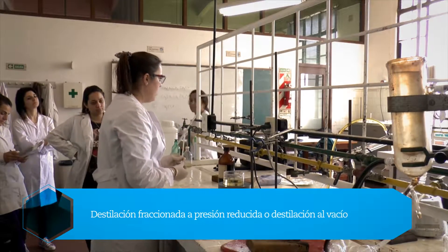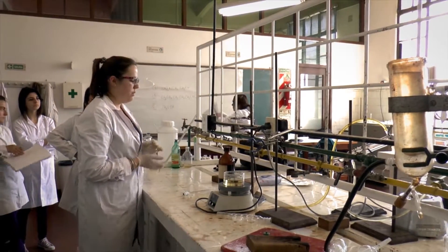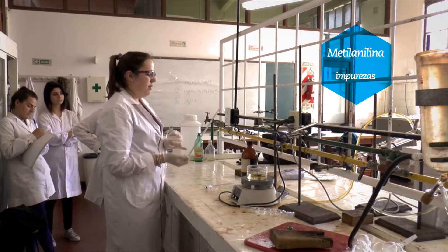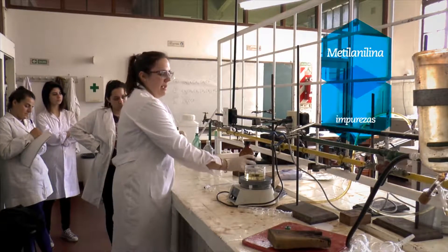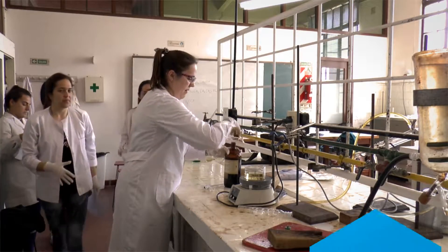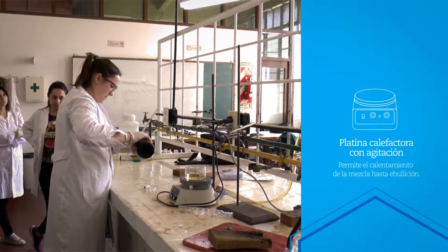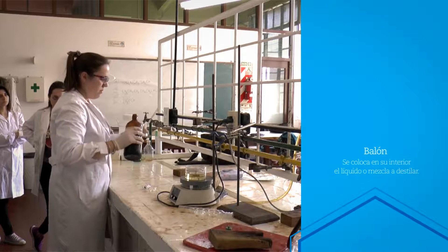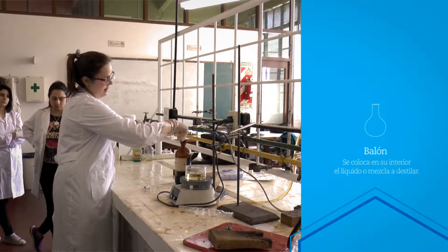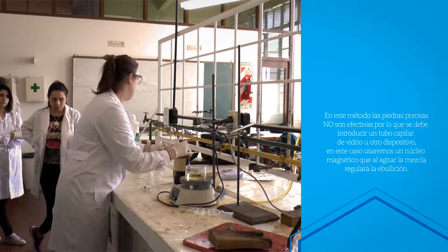¿Qué tipo de destilación a presión reducida? En este caso vamos a purificar metilanilina, que está impurificada. La metilanilina pura es transparente, así que claramente está impurificada acá — tiene un color espantoso.